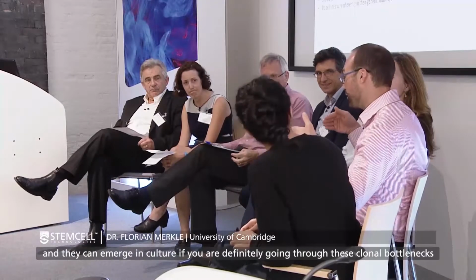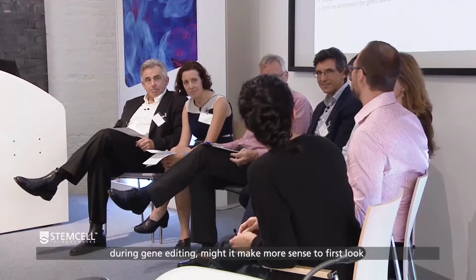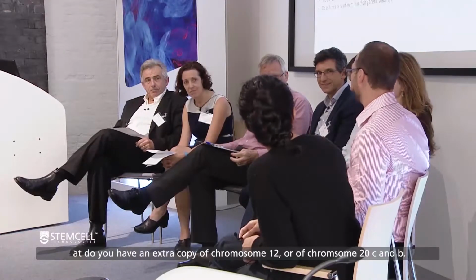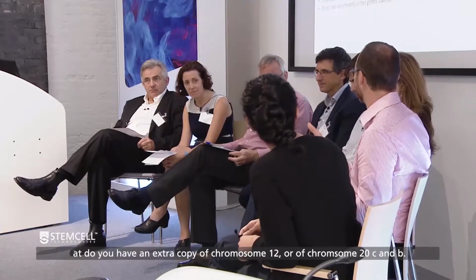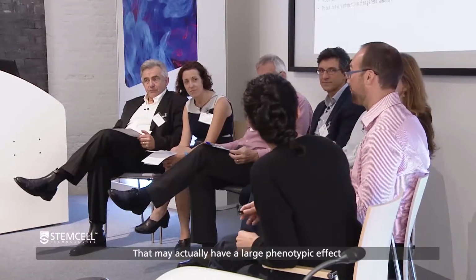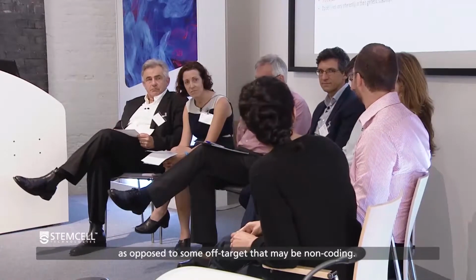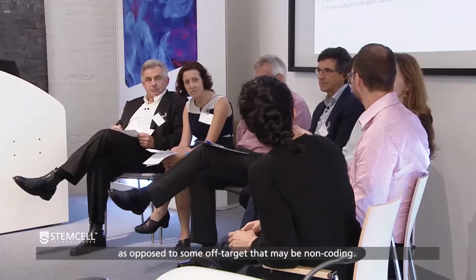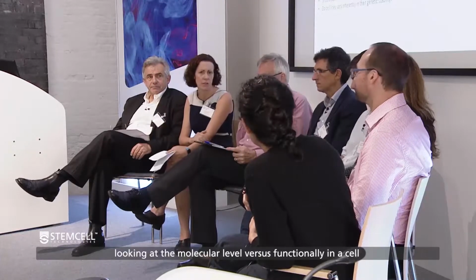And if you are definitely going through these clonal bottlenecks during gene editing, might it make more sense to first look for, do you have an extra copy of chromosome 12, or do you have a chromosome 20 CNV? That may actually have a large phenotypic effect, as opposed to some off-target that may be non-coding. And I guess it comes back to some of the points that I made earlier about the difference between looking at the molecular level and actually what you're seeing functionally in cells.